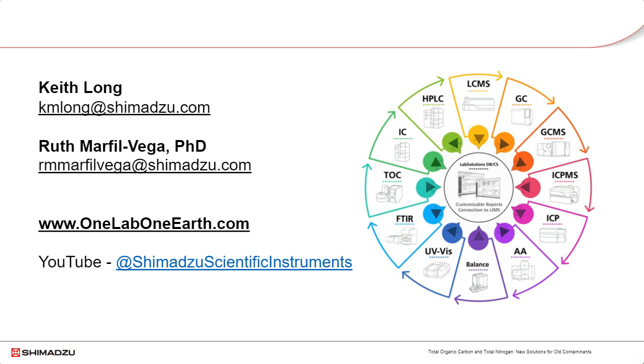For some carbon analysis like NPOC, we need to add acid, right? That's part of NPOC, or non-purgeable organic carbon, where we acidify the samples to a pH of 2 or less. Any inorganic carbon in your sample at that point can be converted to CO2, and we can sparge to remove that. That will have no effect on the nitrogen measurement. So if you're technically just doing nitrogen measurement, you do not need to add any acid. The acid is for carbon measurement, or specifically non-purgeable organic carbon. So whether or not you add acid is more dependent on your carbon measurement, because it has no effect on nitrogen measurement.